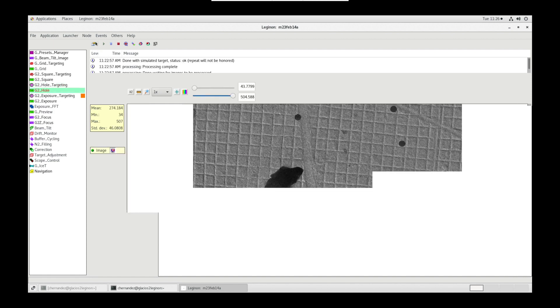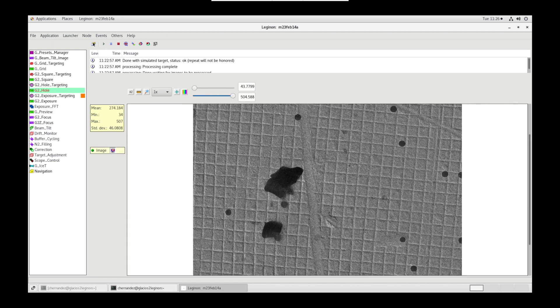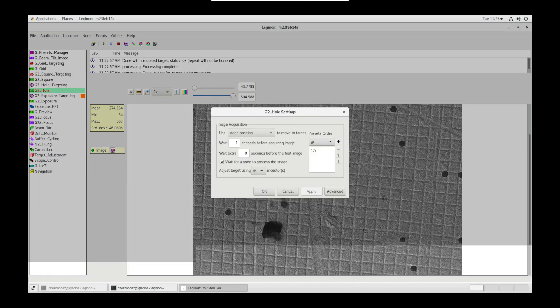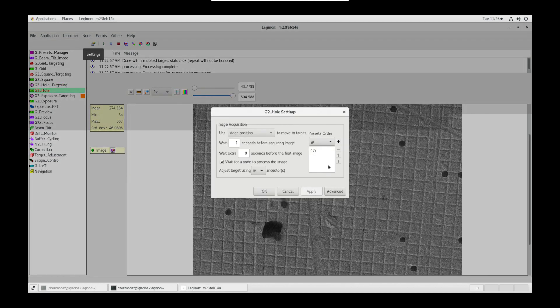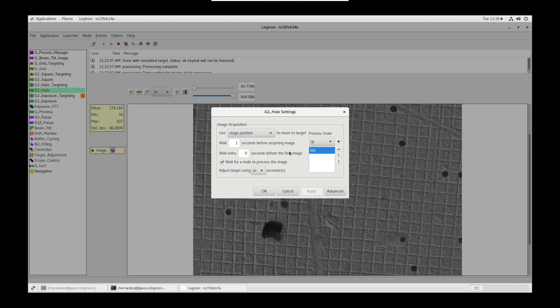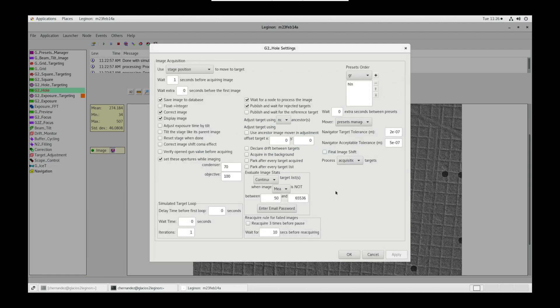Next is whole node settings. Wait for a node to process the image is checked. The preset is HLN. And set these apertures while imaging is checked with these values as well.